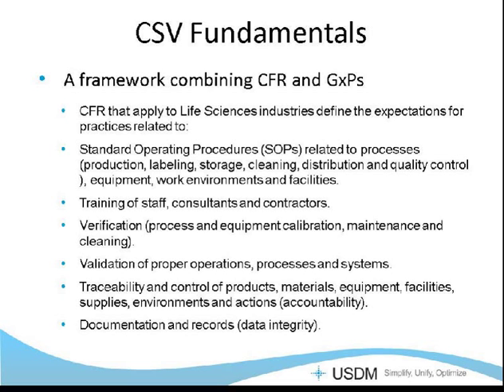Those practices include having procedures in place that describe your business process, whether you're labeling, producing equipment, manufacturing equipment, cleaning equipment, performing quality control tests, or using laboratory equipment. You must have procedures in place to control and ensure consistency in how those procedures are performed.